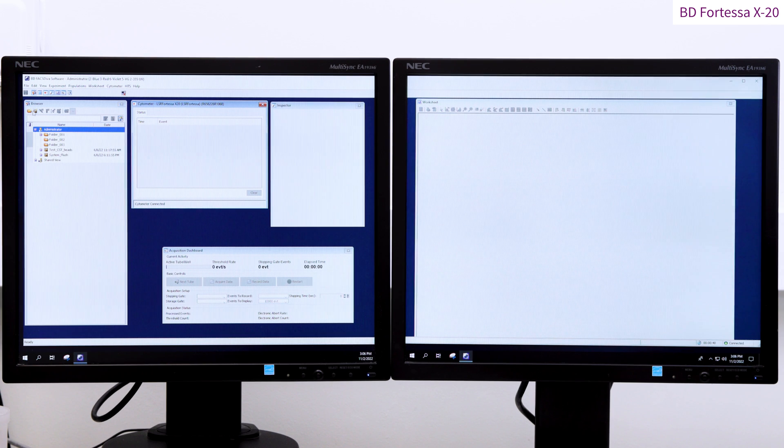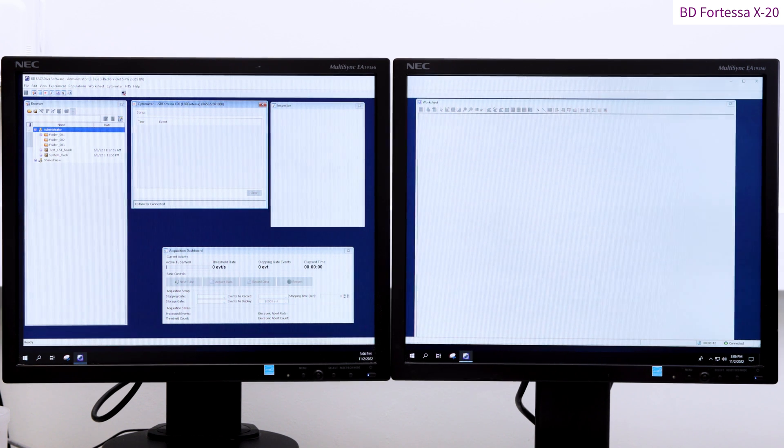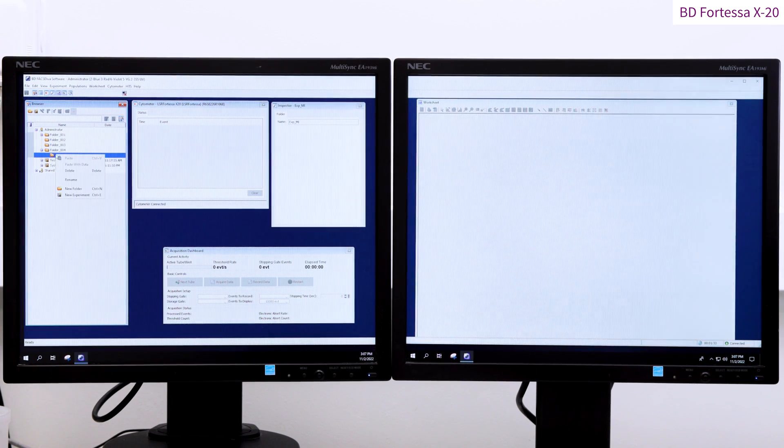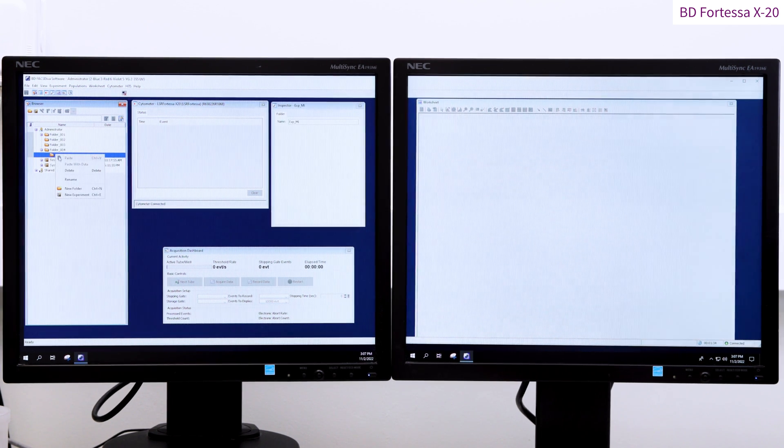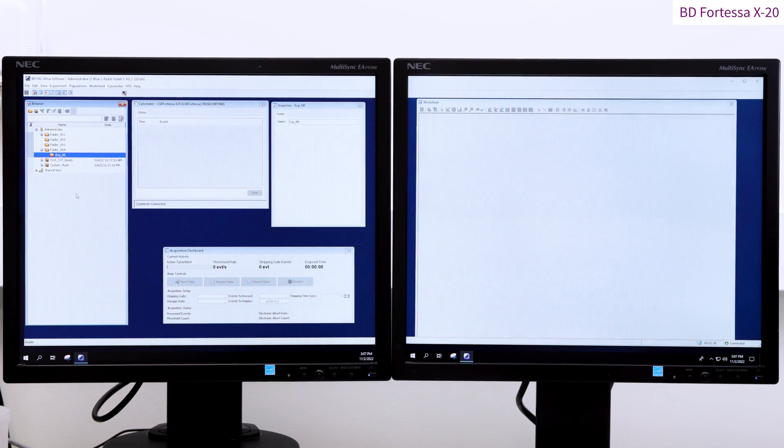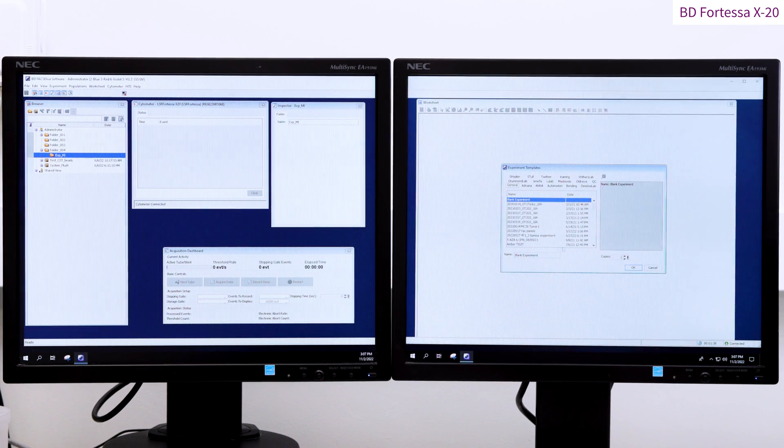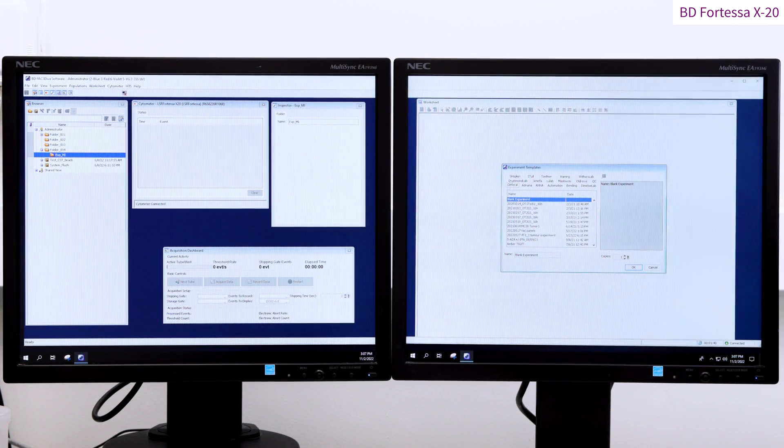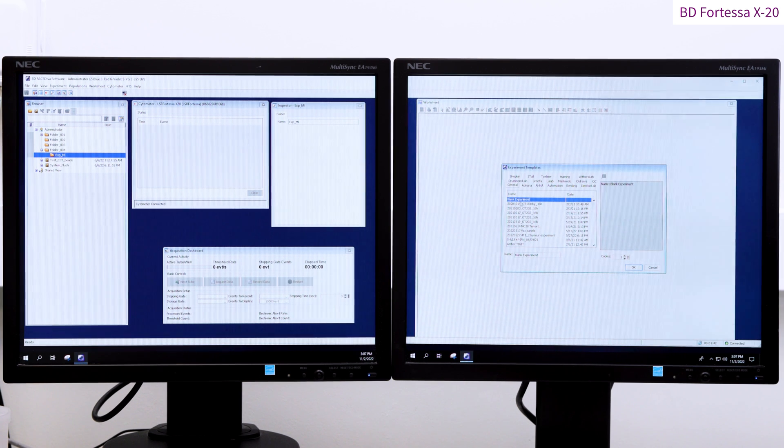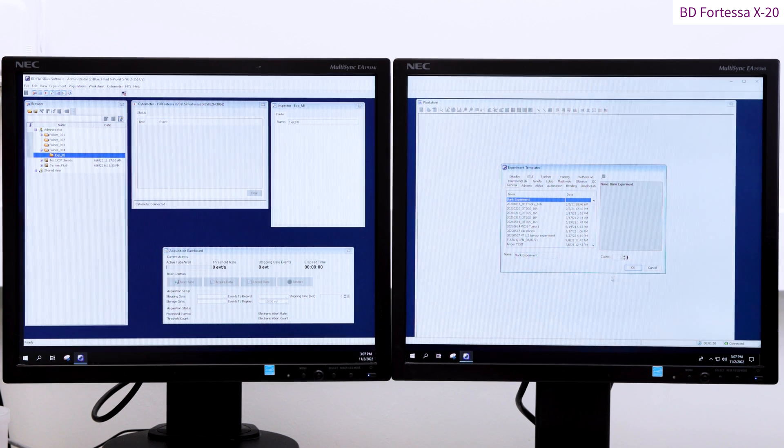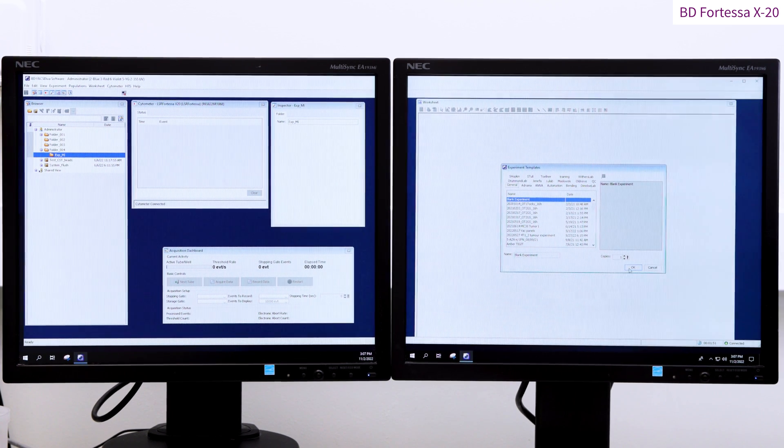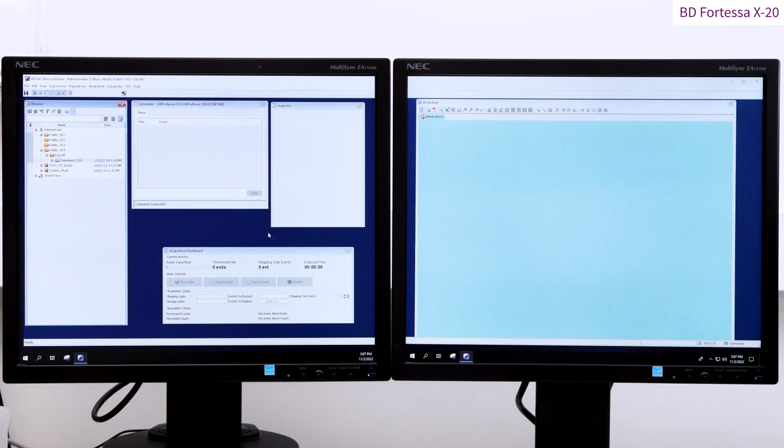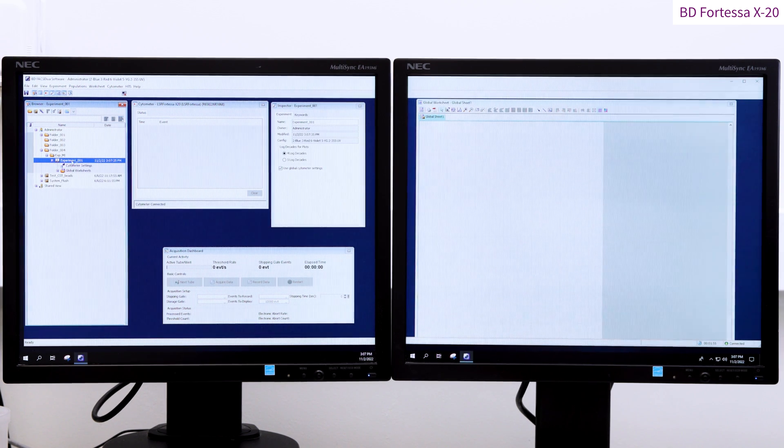You can organize your Diva account by creating folders. Create a new experiment from the browser icon bar via a right-click on your folder. When starting a brand new experiment, select the Blank experiment option from the Experiment Template window. You can rename the experiment via a right-click.